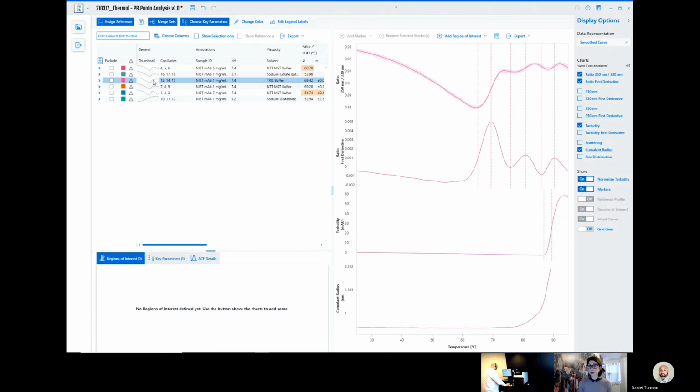Thank you for mentioning that. I'm just scrolling through the data. Some of this, like this particular sample, is beautiful and the markers are really nice. You're looking at an antibody that gives a very canonical unfolding profile where the CH2 domain unfolds, Fab domain unfolds and drives the colloidal stability. And then the last thing that generally unfolds is the CH3 domain in the Fc region. So that is best seen in the NIST at 1 milligram per milliliter. As you increase the concentration, those begin to be blurred.